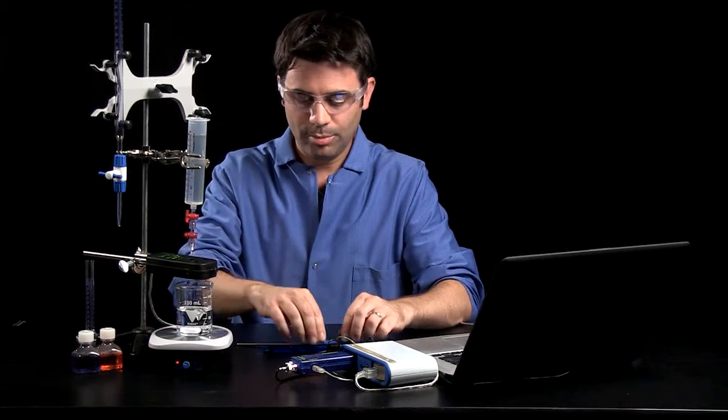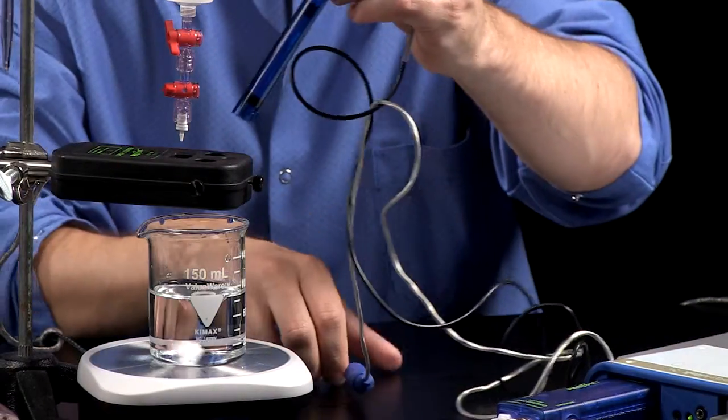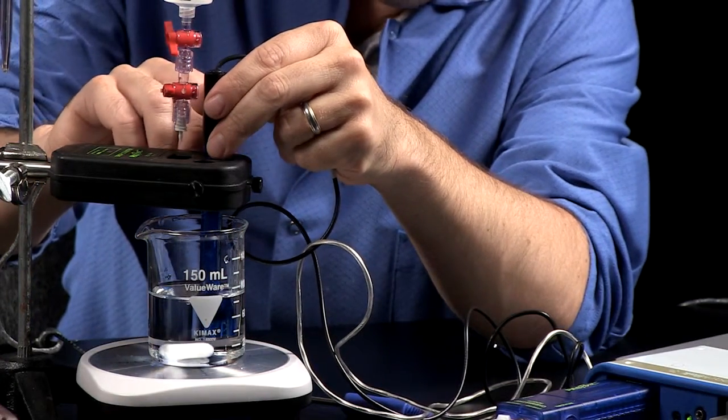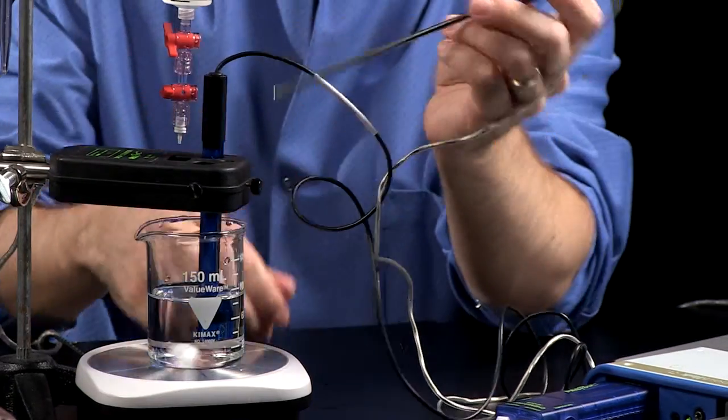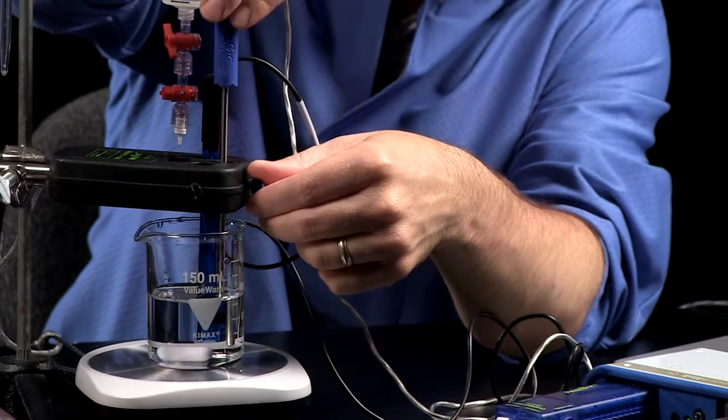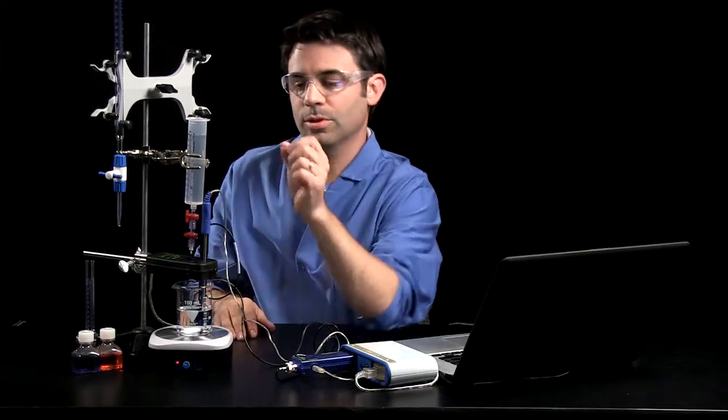So now my measurements are set up, and I need to set up my probes. So I'm going to put in my pH sensor, and I want to put it in far enough so that it doesn't hit the stir, and in this case, I'm also going to put in my temperature sensor. I'm taking advantage of the drop counter's multiple sensor ports. There are three ports on here.